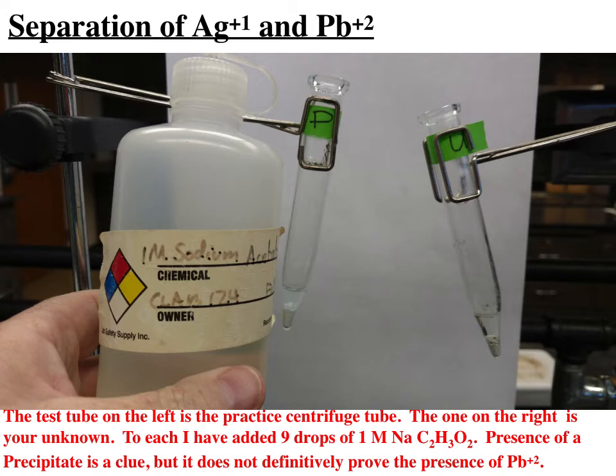So we're going to perform a qualitative analysis experiment on the supernatant to determine if lead is present in that aqueous form. But certainly what we have accomplished now, we hope, is a separation of lead cation from silver cation.